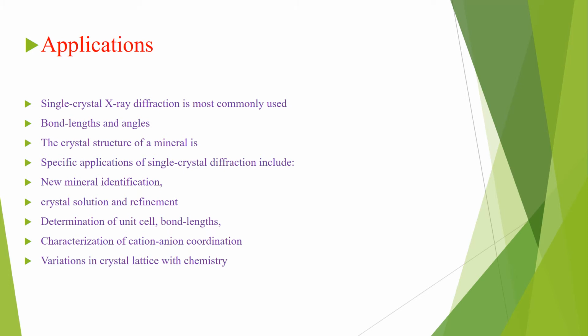Specific applications of single crystal diffraction include the following. Number one, new mineral identification and crystal solution and refinement. This is one of the applications of single crystal X-ray diffraction. That is, we can identify the new mineral and we can solve the crystal, and also we can refine its structure.